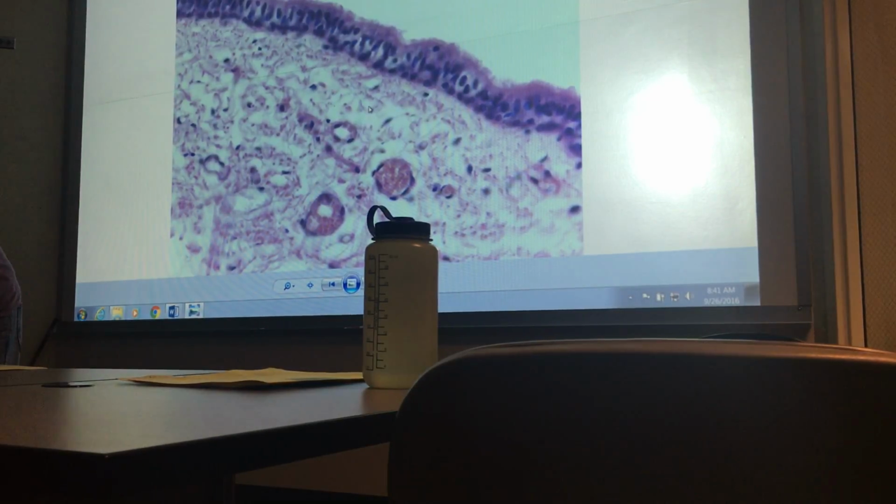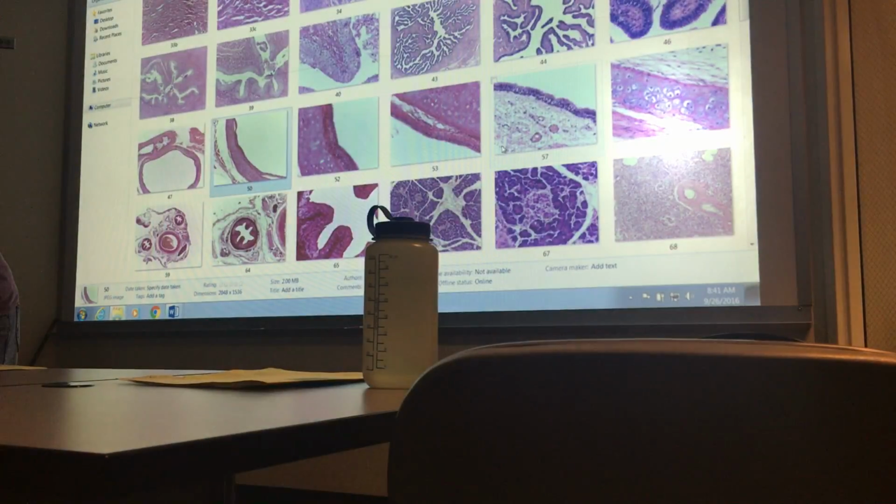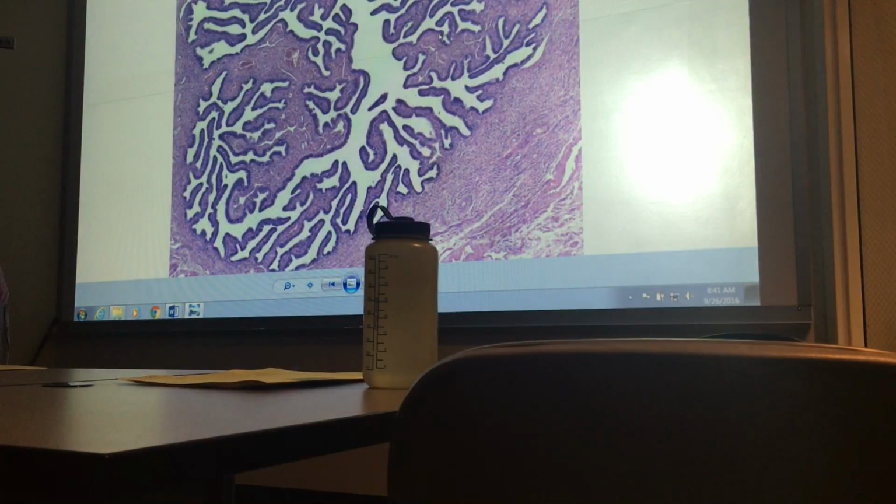The other ciliated tissue is another one that requires a brief, not as detailed as anything we did last week, but a brief turn on the lights and draw a picture. So this is a very low magnification of a cross section through the fallopian tube, also called the uterine tube, also called the oviduct. In humans, it's most commonly called the fallopian tube. It is convoluted, and those convolutions do increase the surface area, but they're also very important to trapping gametes.